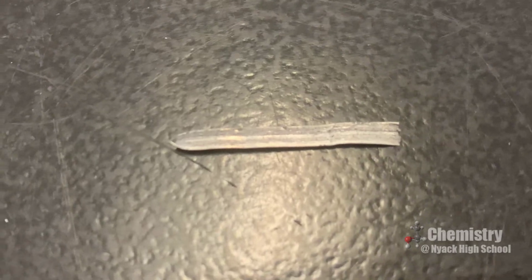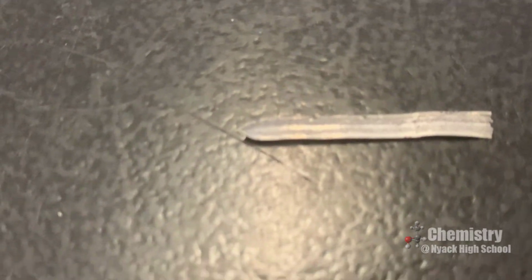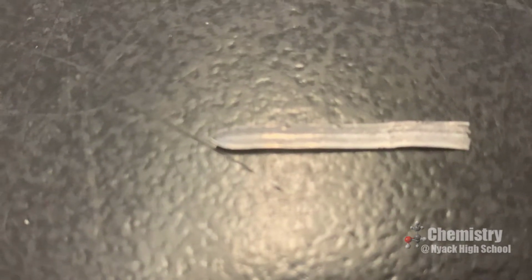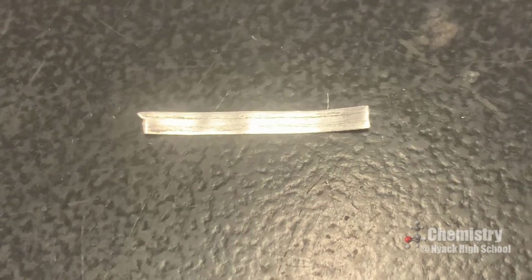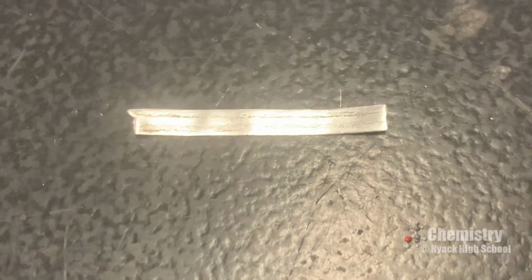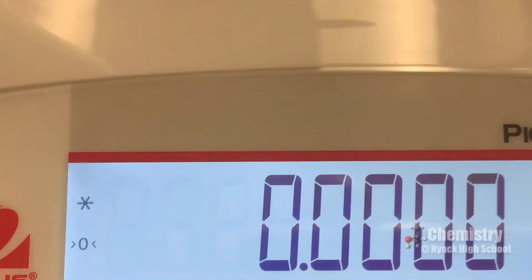So as you can see, this piece of magnesium has a certain amount of oxidation on it. First thing I'm going to do is to strip off the oxidation to ensure that the piece of magnesium that I'm using does not contain the magnesium oxide coating. So as you can see, the magnesium is a lot shinier. It has the characteristic luster that you would expect from a metal. I was not able to get all of the magnesium oxide off the surface, but it should be good enough for our experiment.